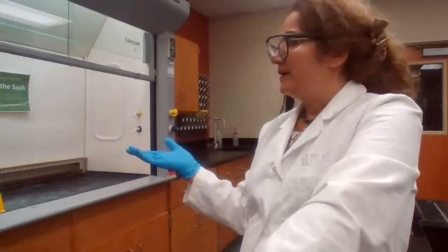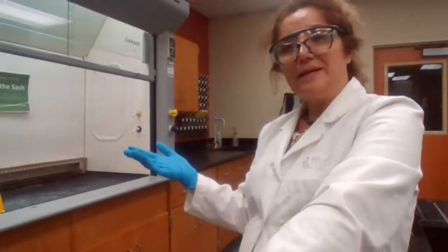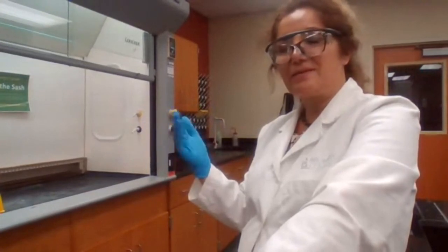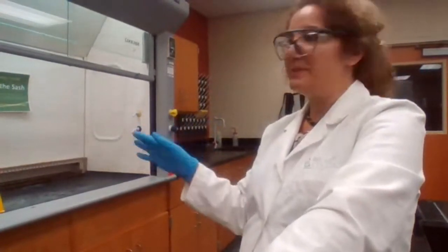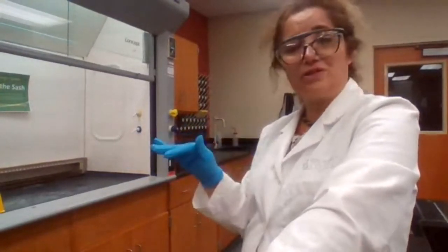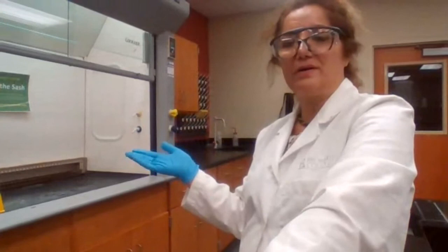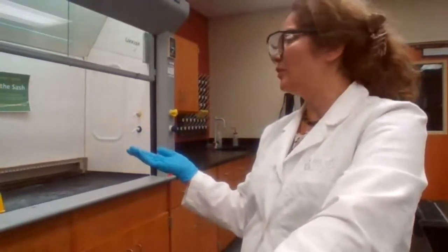Now, if the solution is boiling, the temperature is not going to pass much higher than 50. But if the temperature of the mixture reaches 60 degrees, at that temperature you are 100% sure that there is no more of the ether left. So you can stop the boiling.